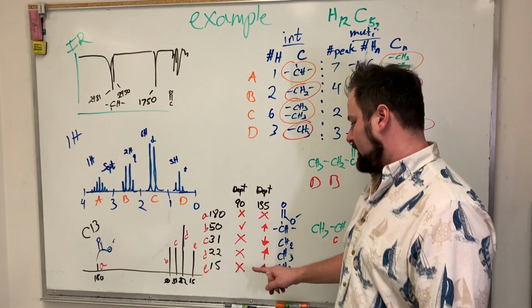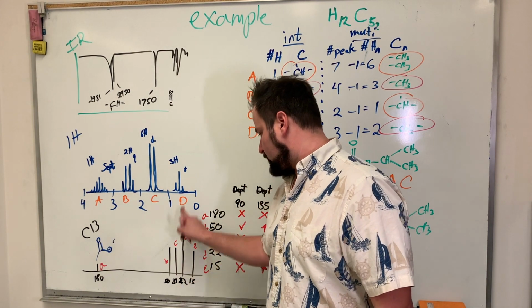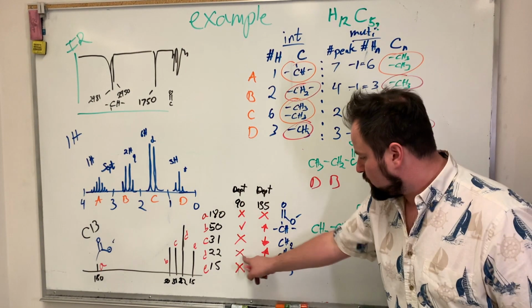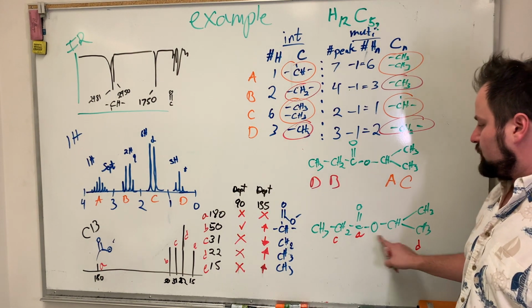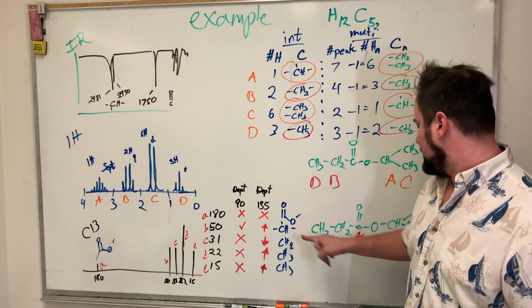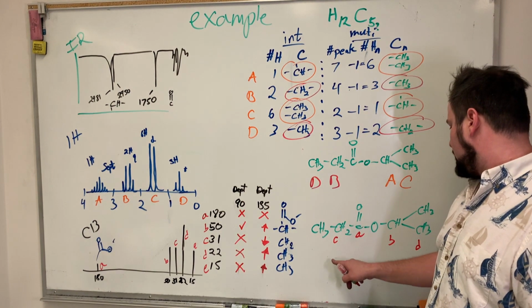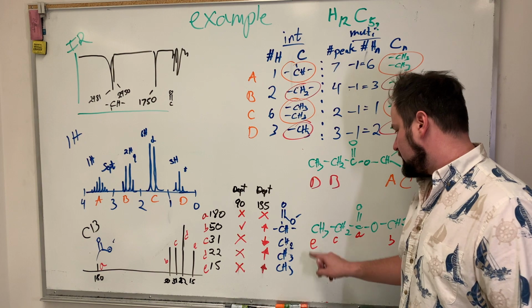Then the 22 here is twice as tall, and so we would expect that to be these guys over here. So that's 22, which we call d. That means these two are going to be d. And between these, we said that this is a CH3 and that's a CH. So our CH has to be b, and this has to be our remaining one here, which is a, b, c, d, and e. So that's e.